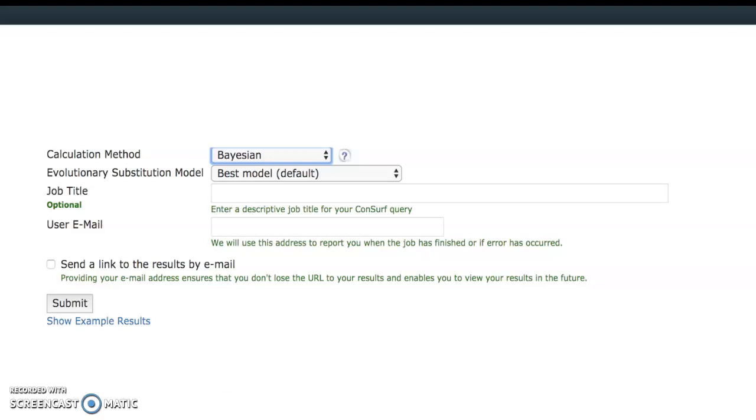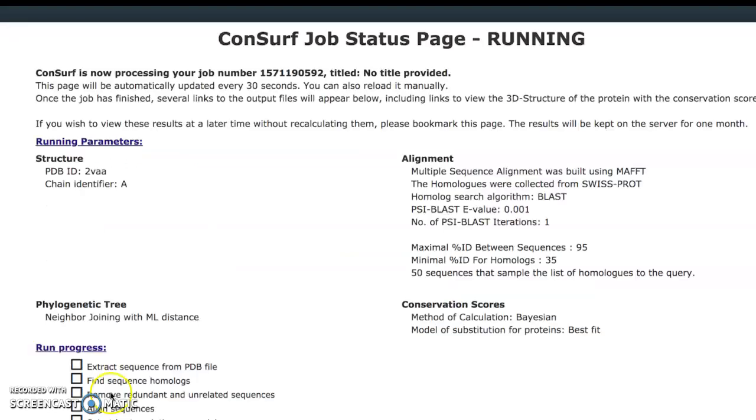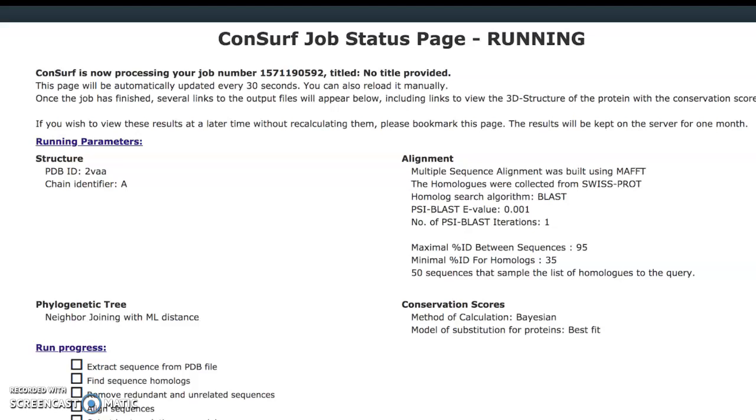For me, when I was running my example, I just kept the window open while the job was running and it finished in about a minute. This is what your running page looks like while you're waiting on it to finish. After you submit your job, it'll also tell you where it pulled all of its additional data from. Different websites such as Swiss-Prot, the data bank, and BLAST were used here.